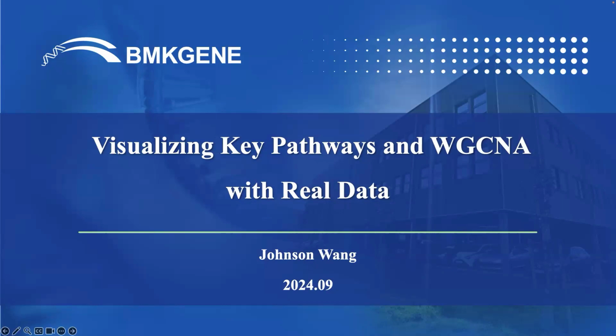The session will help you master how to use real data on the BMKCloud to enhance image presentations and conduct in-depth gene co-expression network analysis, improving your research visualization and data interpretation skills.